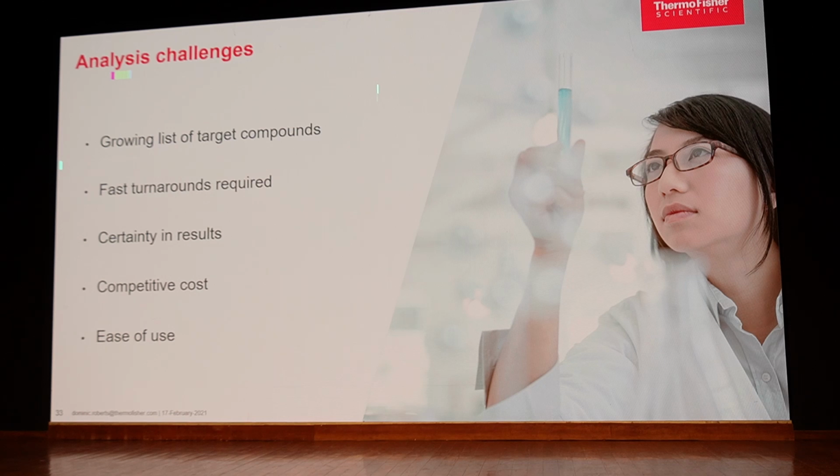and that's why HRMS plays a very important role, where you can do untargeted analysis also through a retrospective approach. In the case of a triple quad, you analyze 100, 200 or 500, or maybe 15 molecules as a target-based approach, and once you finish that analysis, that activity is finished. But with the same sample preparation, when you acquire the data using HRMS, you can do targeted reporting first, and then you have another possibility of retrospective analysis.